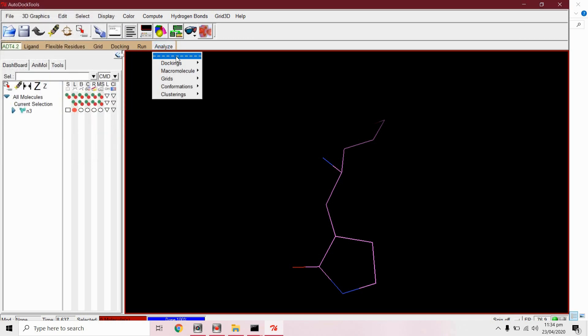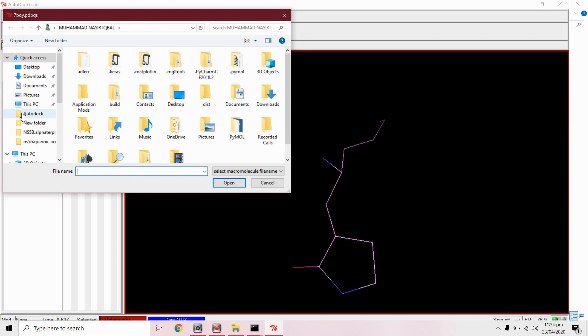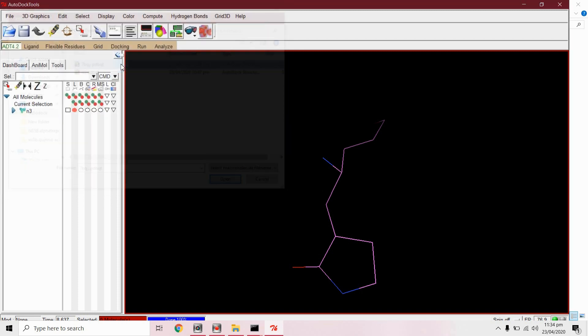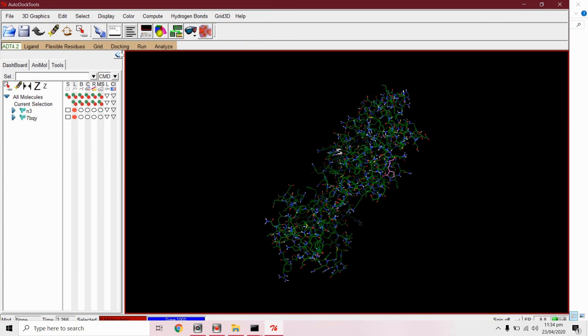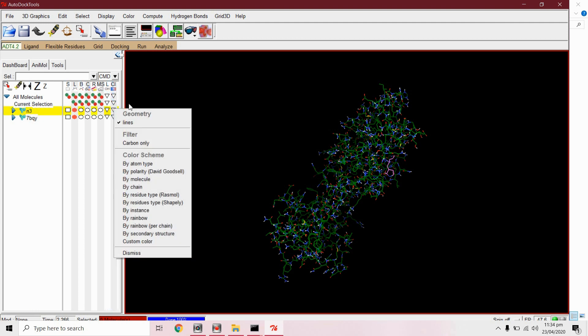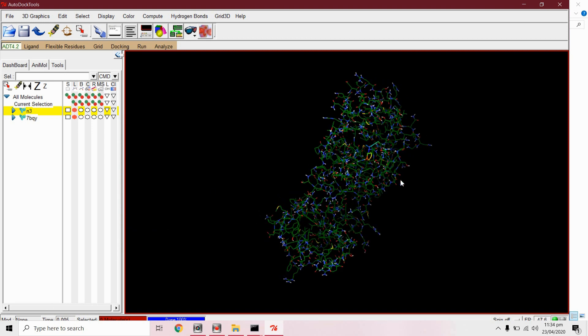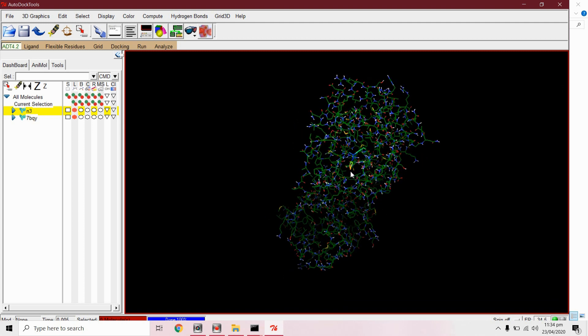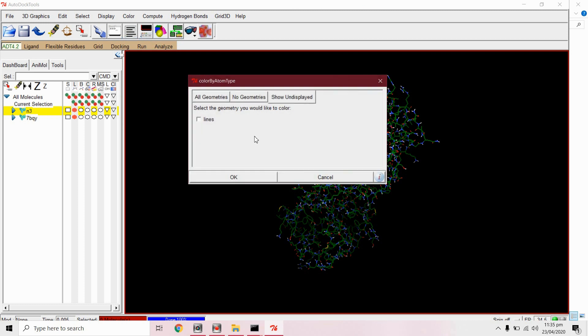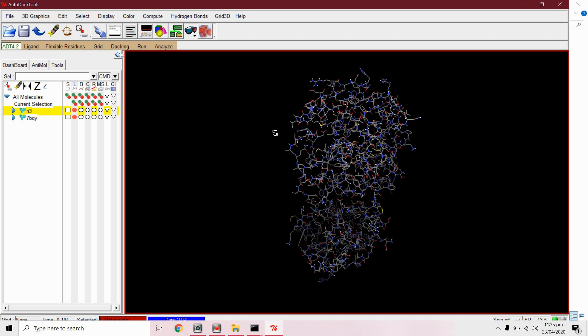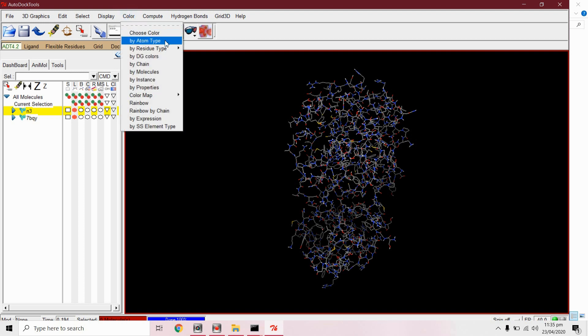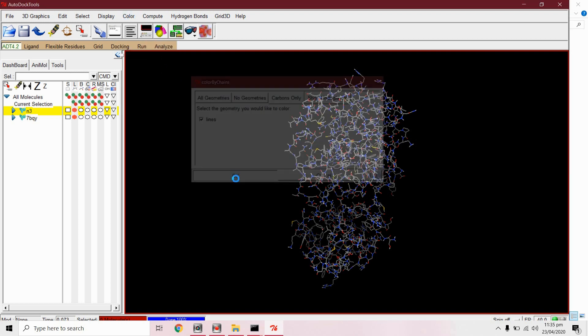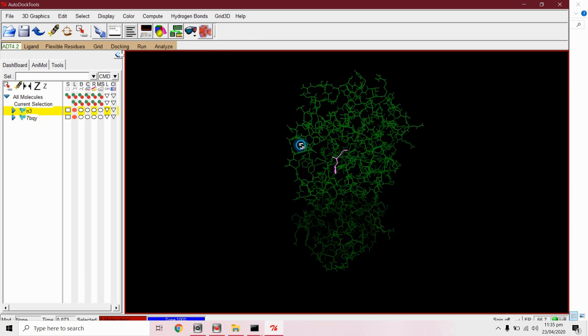Now from analyze macromolecules open. We will open this protein file in dot PDBQT format. Here we have a ligand, here we have our ligand. Here from color by atom type. Yes we can take a better look now.